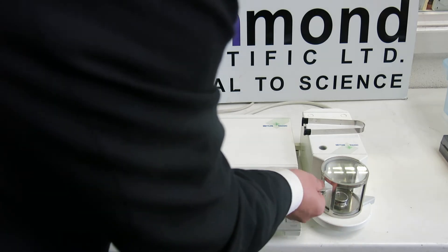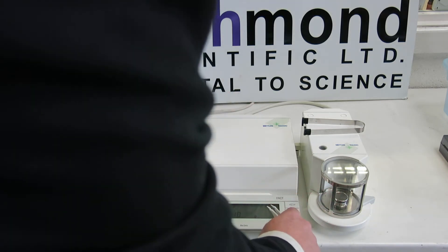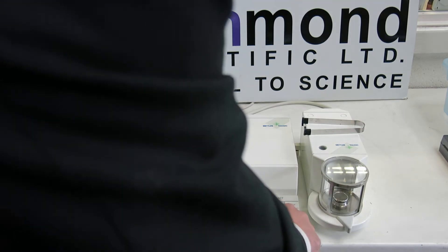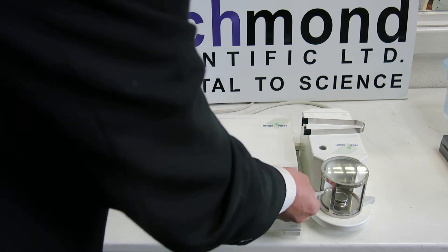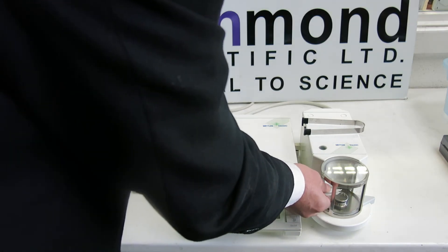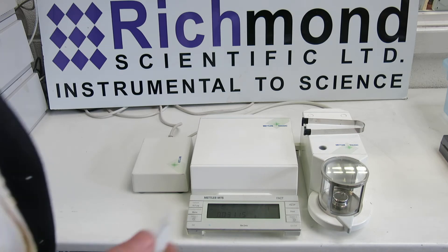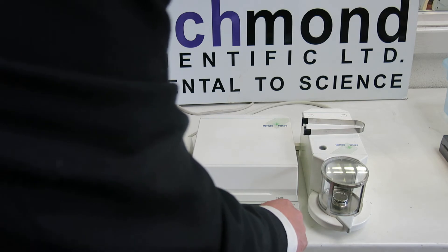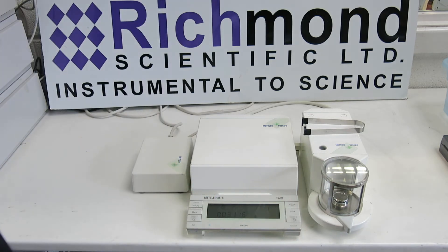Take this off very carefully. Close it. Open it up again. Put it back on. Close it. So we've got 3115 there — 3116. Perfect, which is what it was before. So there's the repeatability.